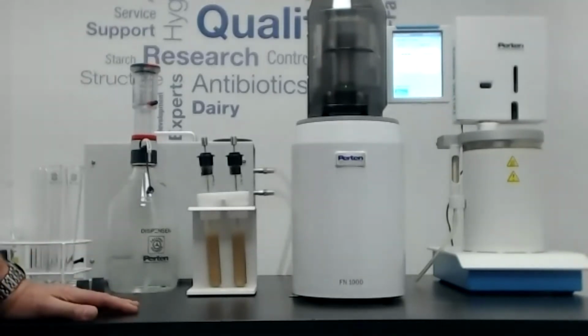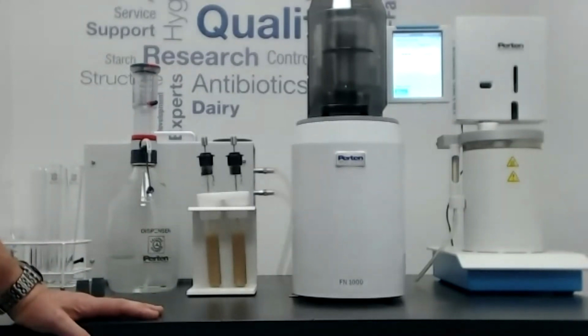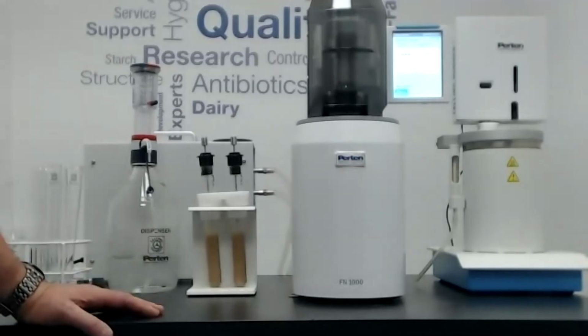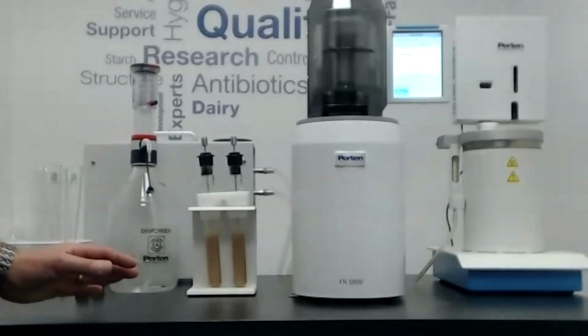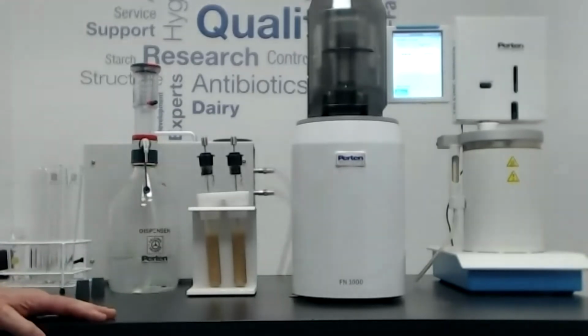Some of the things that we find when we're on site is distilled water, so double check the quality of the distilled water. We found on a couple of occasions when we've gone on site, we've done some tests with the reference flour and it's been failing. When we've looked into it a bit further, we've used clean, fresh distilled water and the test passes perfectly well. So even though you're replacing this every day, make sure that the device you're using for producing the distilled water is actually working okay. It can cause problems. It is something that we haven't seen in the past.